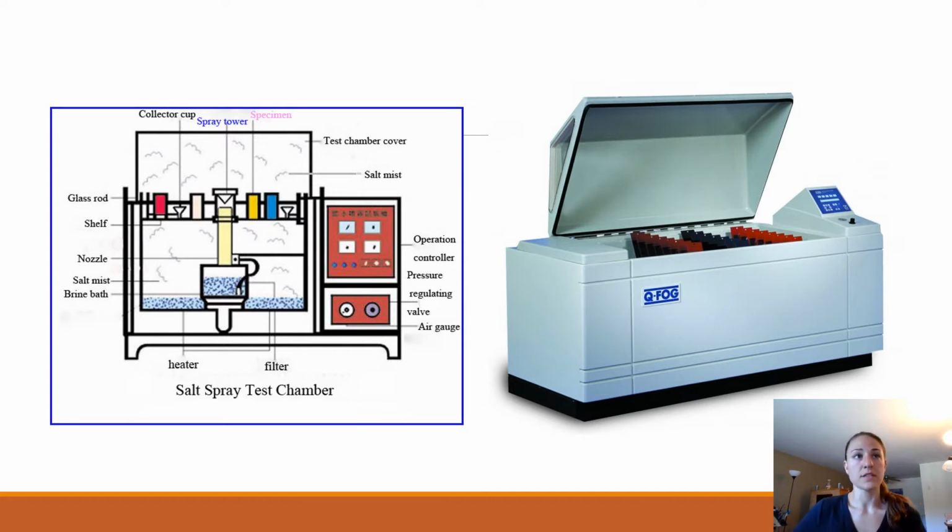And then on the left, you can see in the middle there's the spray tower. This is connected to an atomizer, which creates a fog or a mist of our salt solution, which is collected onto your test specimens. And generally, we'll keep these in there for anywhere from 500 to 2,000 hours.